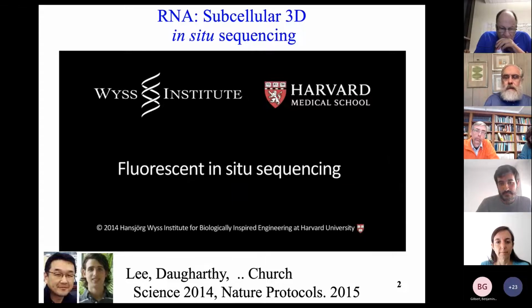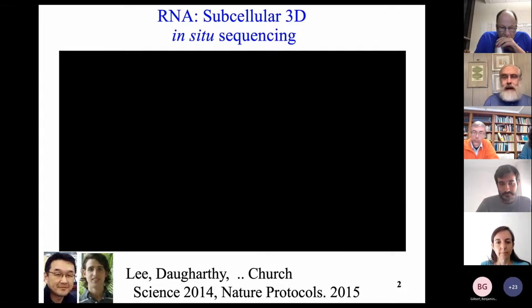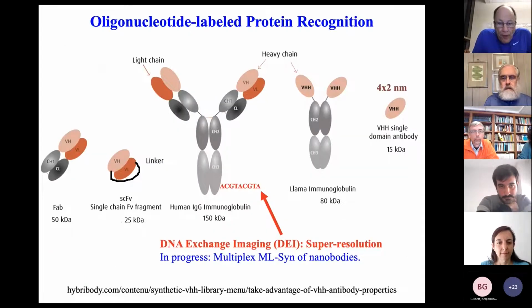So we're not getting every single RNA molecule, of course. We aspire to do that, but you'll see in a moment how we can get more real estate to do that in. One way is to get higher resolution, and the other way is to get expansion of the cell in a moment. So that's DNA, RNA.